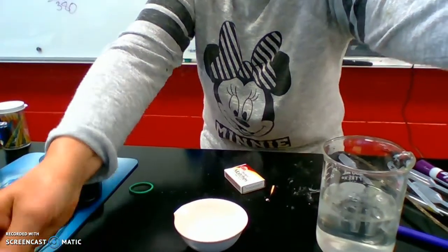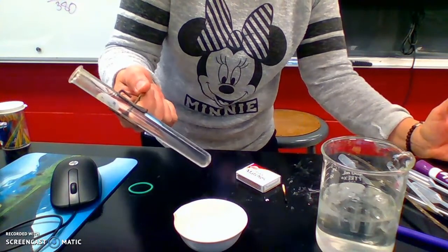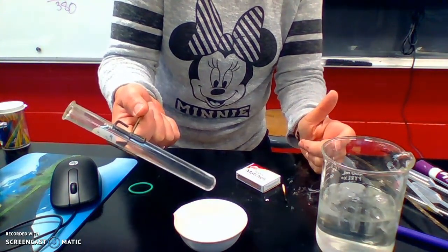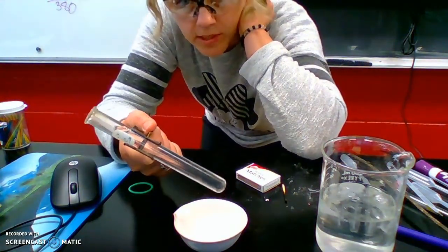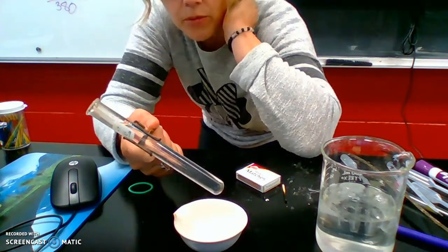It burns at such a clean flame. I don't even know if you can, I guess you can see that a little bit. All right. So I'm holding my very cold test tube kind of over this, and I don't know if you can see, immediately we see condensation just very briefly forming on the outside of that test tube. So we see that condensation forming. That actually tells me, and I think it's done burning already, which is good. And that's all we see for a reaction. So not super exciting, however very telling.